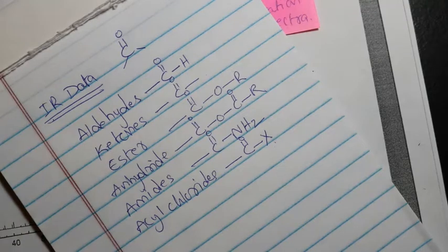And also carboxylic acid, but I'm not writing down the carboxylic acid because we already confirmed there is no carboxylic acid functionality in the molecule.